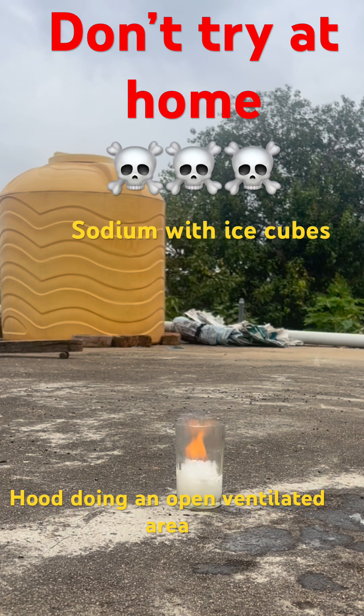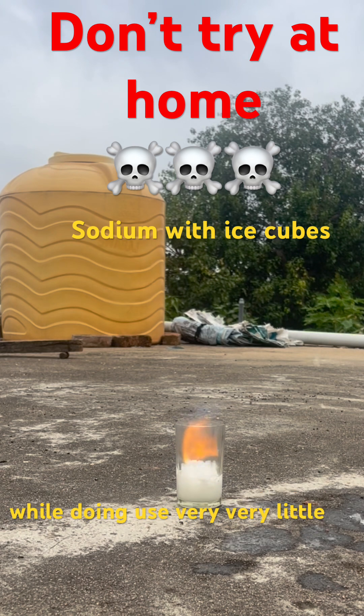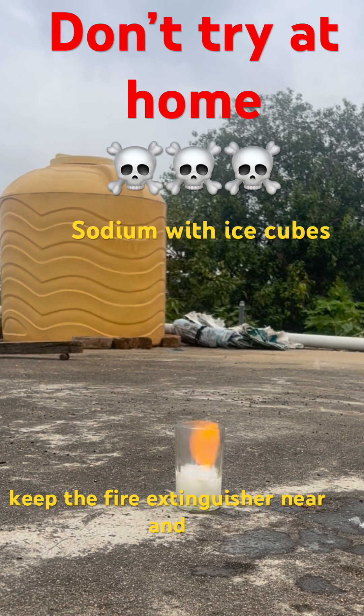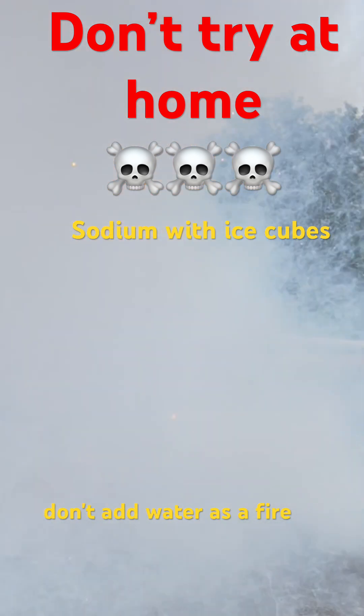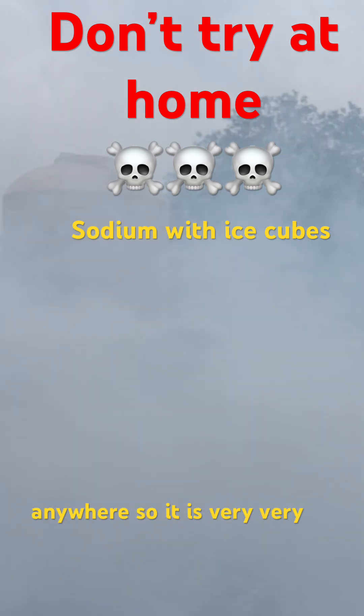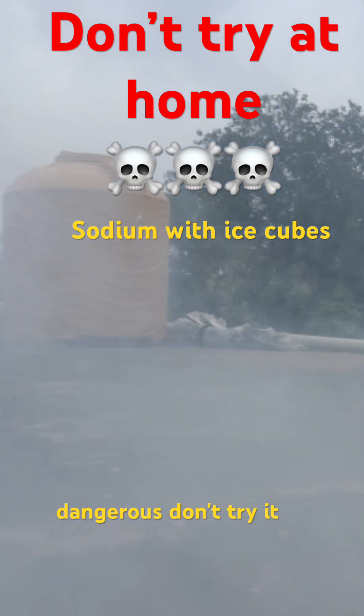Do the reaction under a fume hood or in an open, ventilated area. Use a very, very little amount of sodium. Keep a fire extinguisher nearby, and don't use water as a fire extinguisher because it will catch fire. It is very, very dangerous — don't try it anywhere.